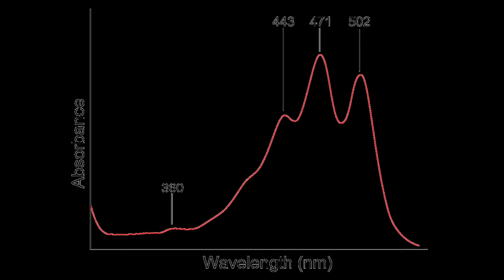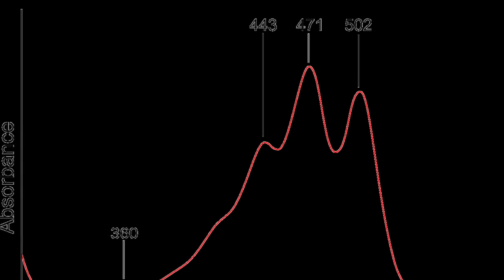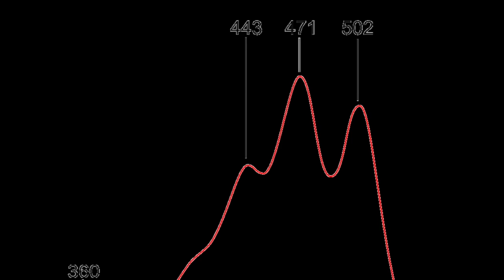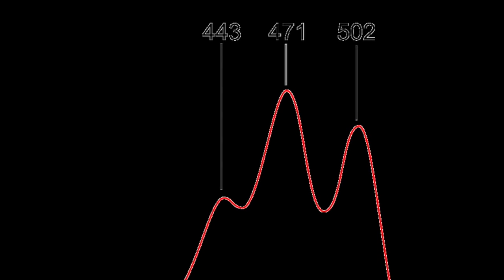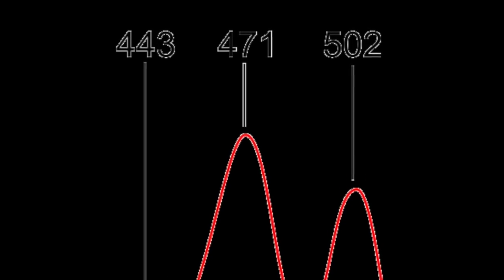It is important to scan across all wavelengths at first in order to find the lambda max. Lambda max is the wavelength at which the solution absorbs the most light in the spectrometer. It is at this wavelength we will require the best absorbance readings.